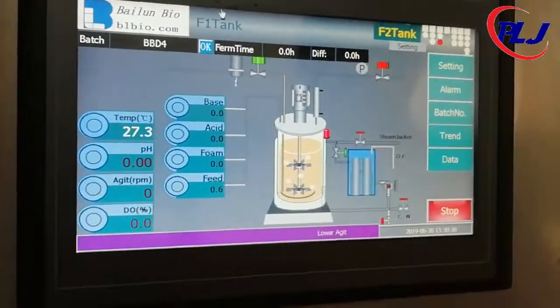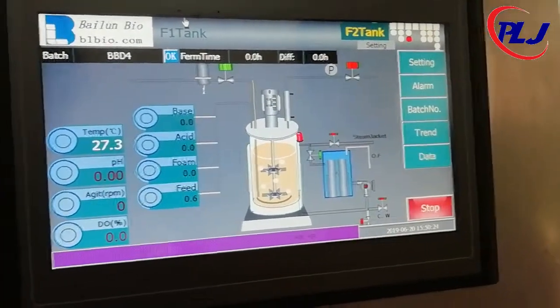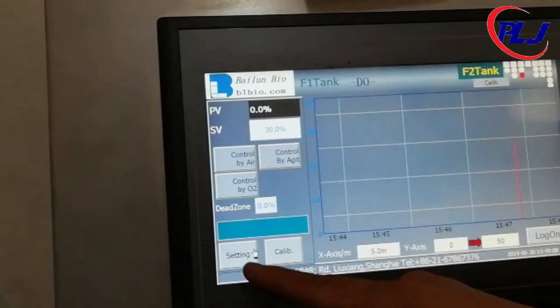To access the parameters, just click on the parameter symbols. A graphical representation of that parameter against the time should appear. On each parameter, there is an SV and PV symbol on the left side of the screen. SV represents the set value, while PV represents the process value.